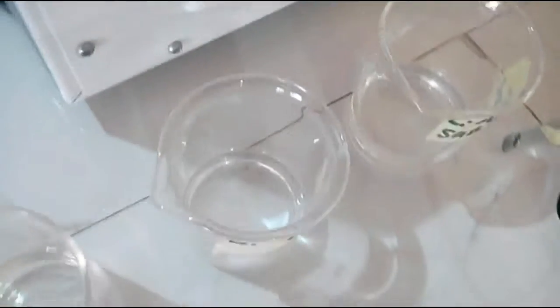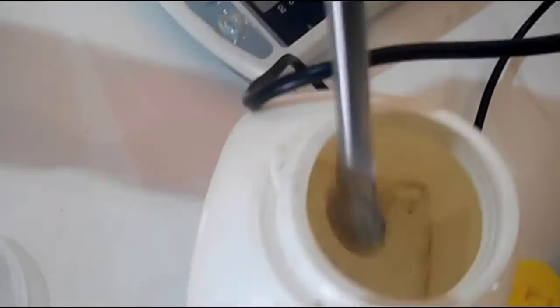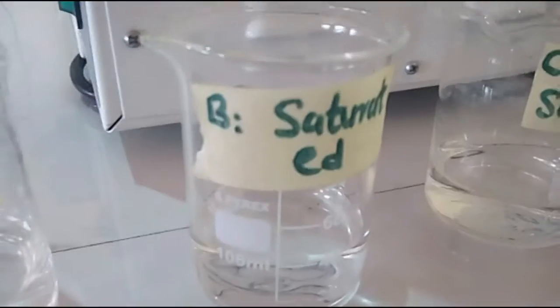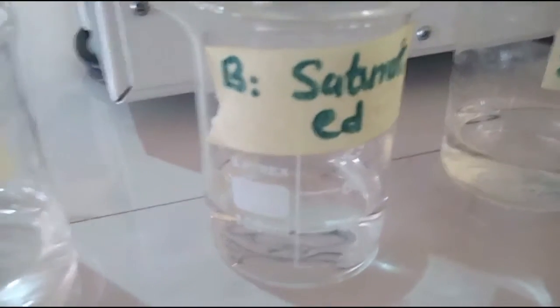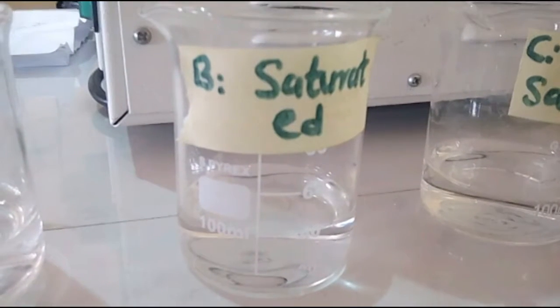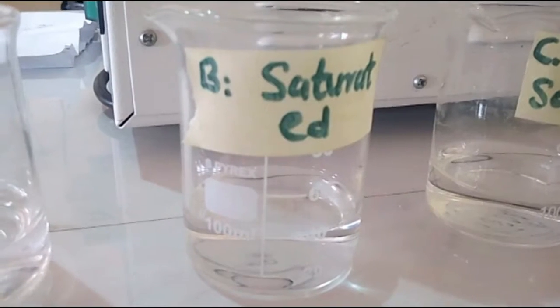Here, the water inside our beaker is the solvent, while the solute will be sodium chloride. The saturated solution is the determinant for preparing the unsaturated and supersaturated solutions. Because a saturated solution is a solution that contains as much solute as it can dissolve in a solvent at a given room temperature.